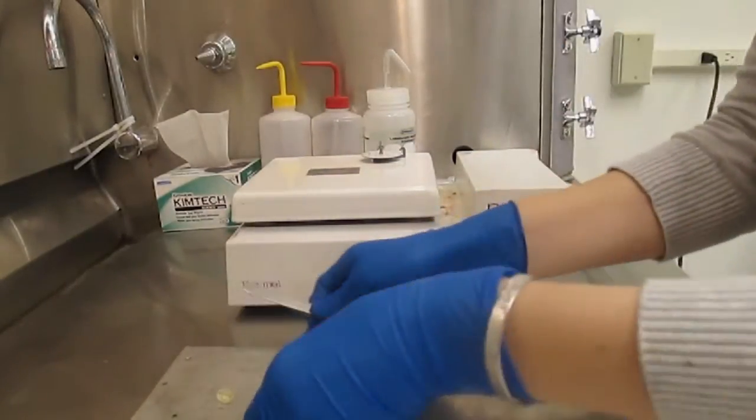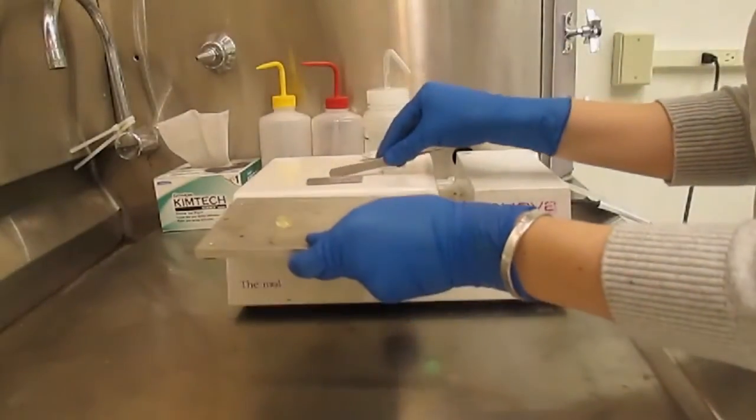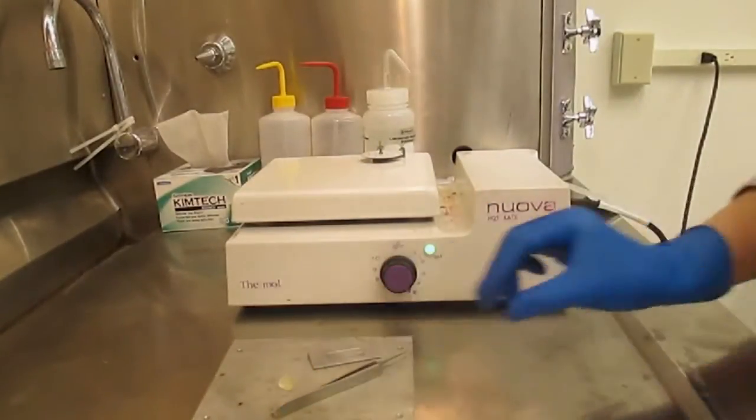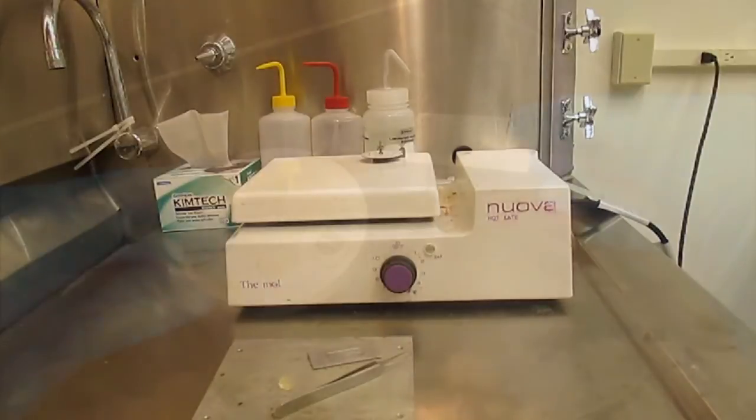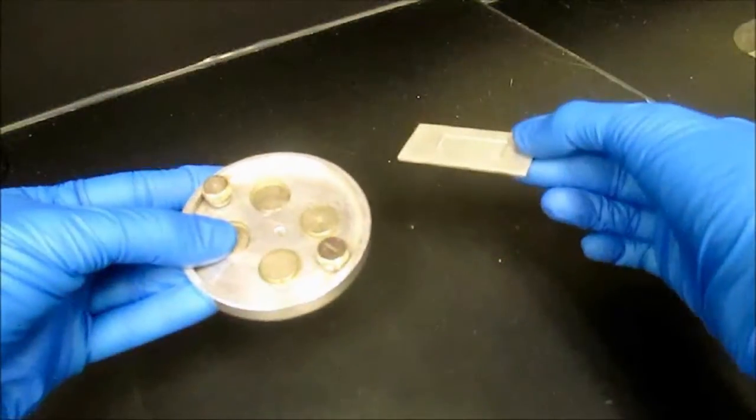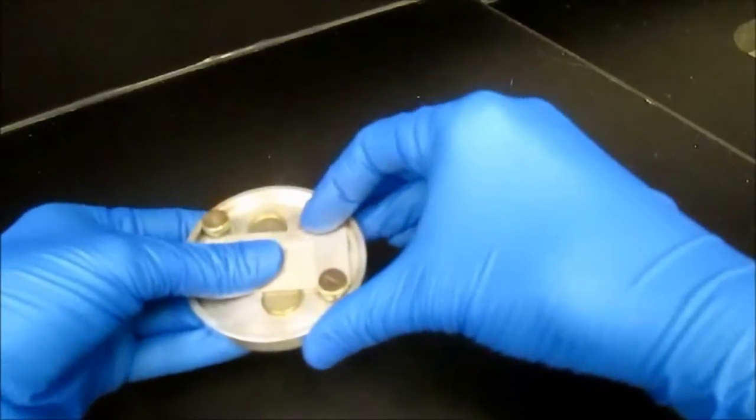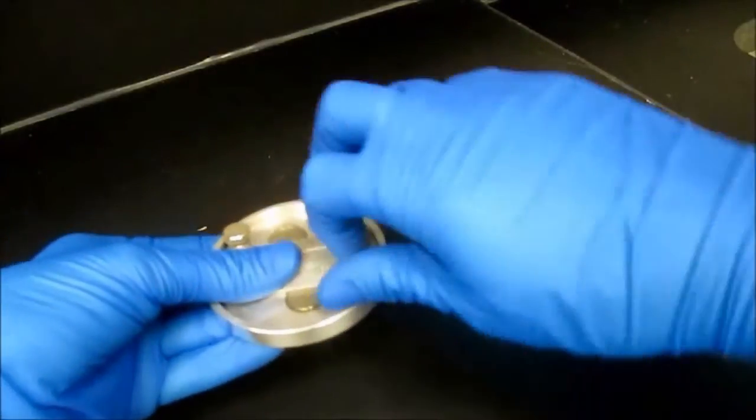Remove the specimen plate from the hot plate and allow it to cool to room temperature. Place the specimen plate under the thumb screws of the disk cutter's specimen container assembly. Tighten the screws firmly.